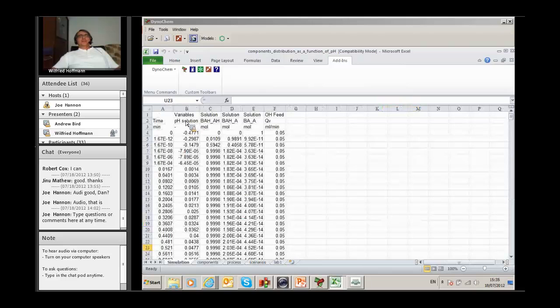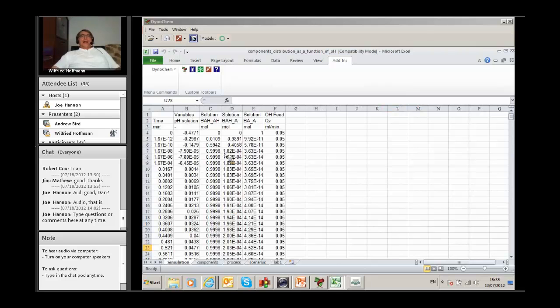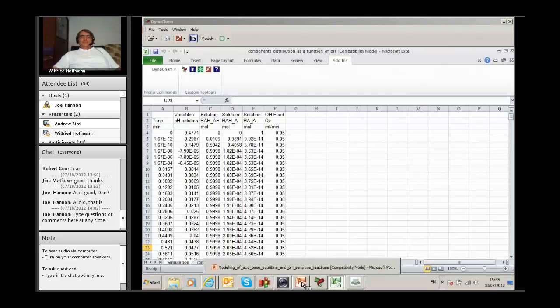So you see they are sorted here as usually in DynoChem with the time as the x-axis, but if you make another graph maybe in another graphic package and you use the pH as the x-axis, then you will get exactly what we want. I show you the resulting curve, go back to the PowerPoint here.